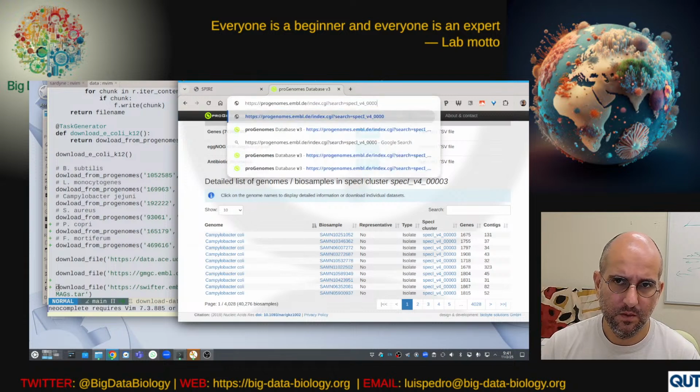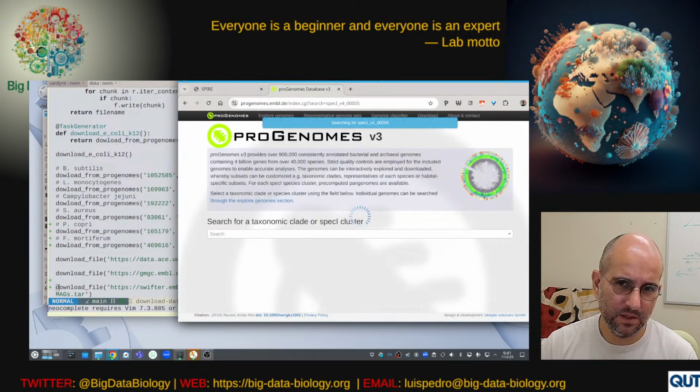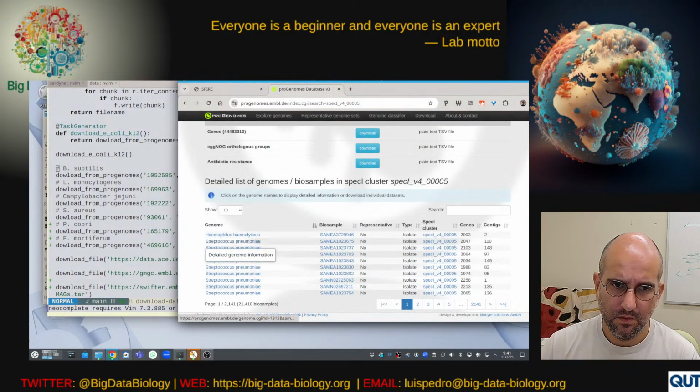Campylobacter. That's probably Staph aureus. Alright, let's skip 4, guessing it's Staph aureus, and go to 5. Streptococcus pneumoniae.